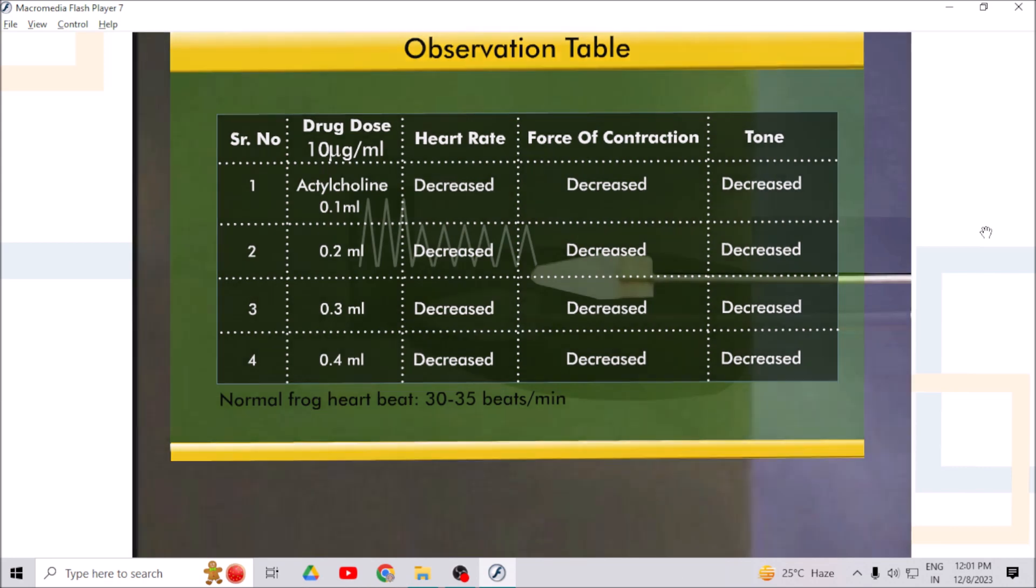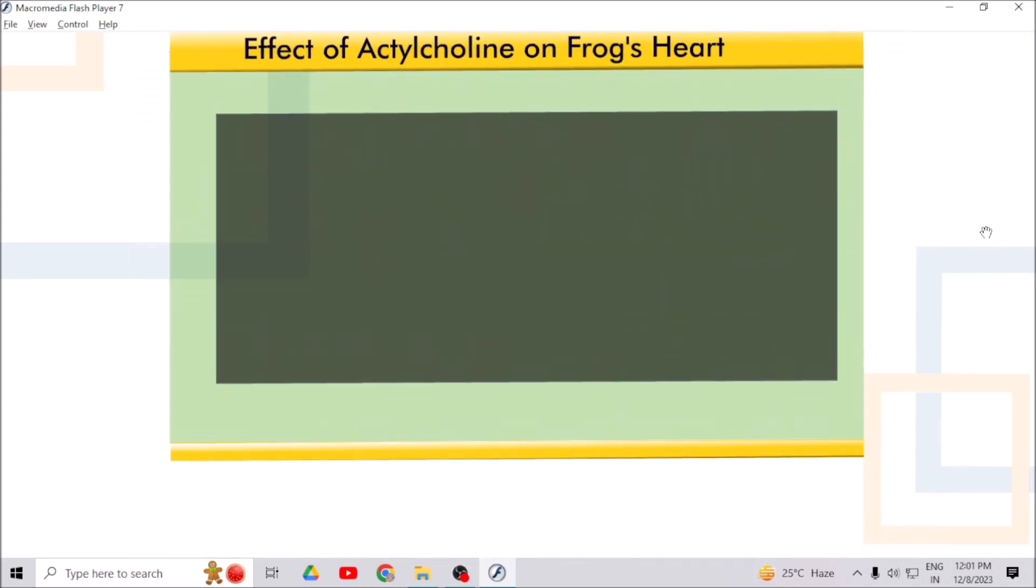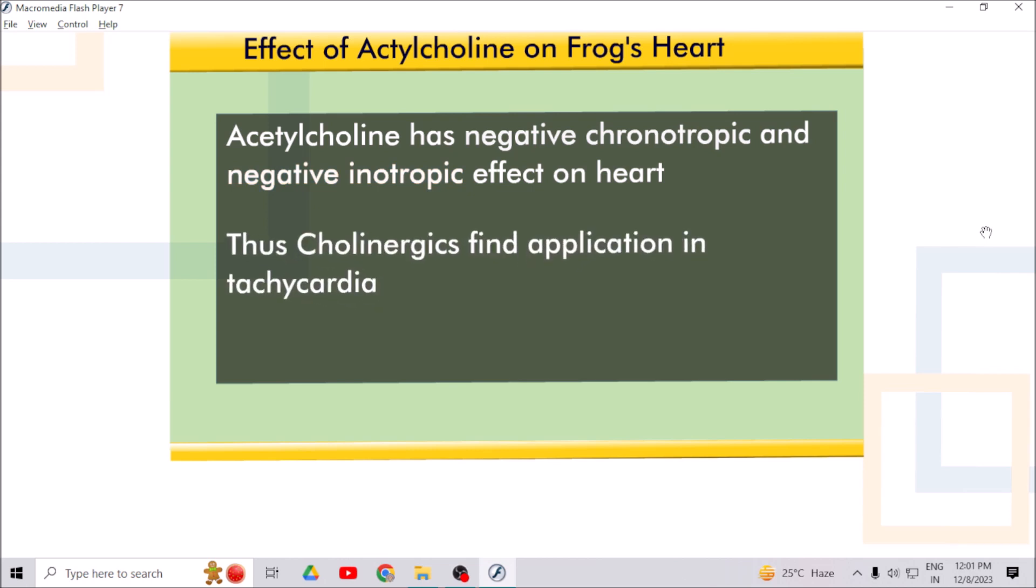From these observations we can say that acetylcholine has negative chronotropic and negative inotropic effect on heart. Thus, cholinergics find application in tachycardia.